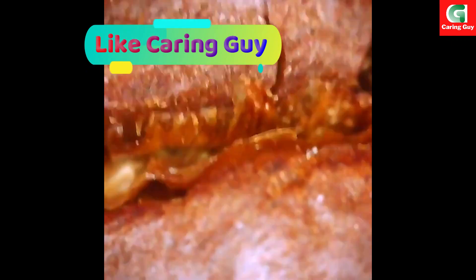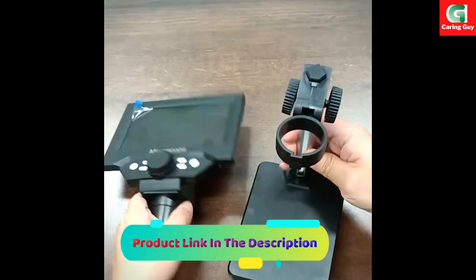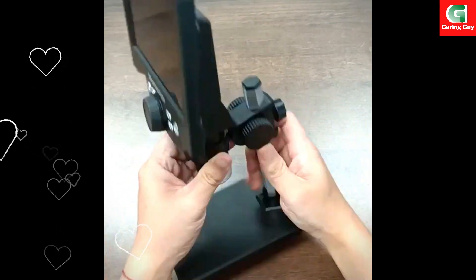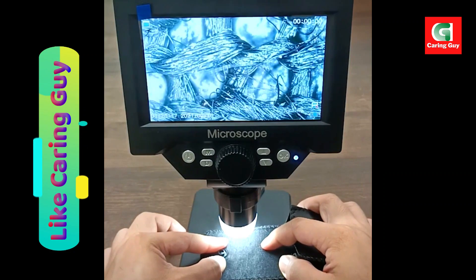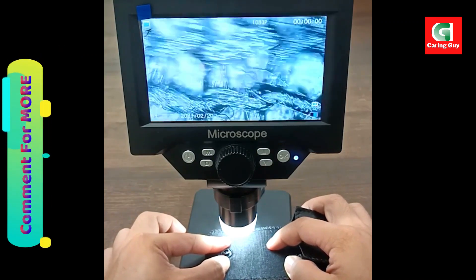5.5-inch LCD display: the digital microscope features a 5.5-inch LCD screen with 500x to 1000x magnification. The eight adjustable LED lights provide a bright field of view, making it suitable for use in various environments.